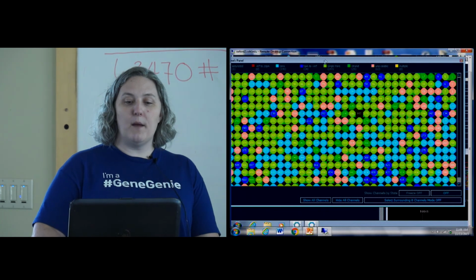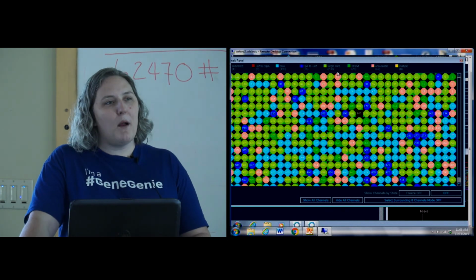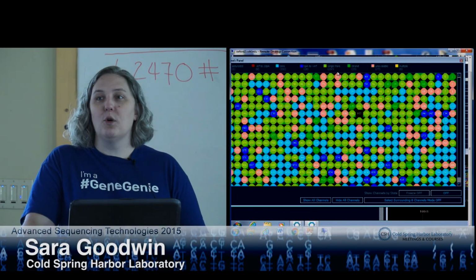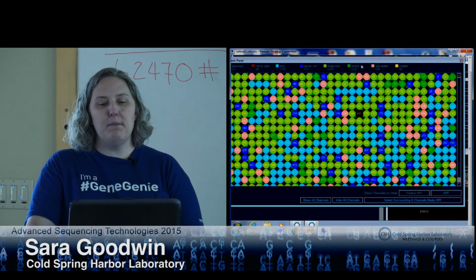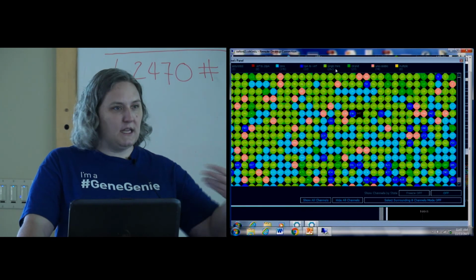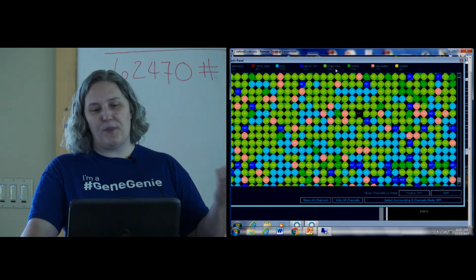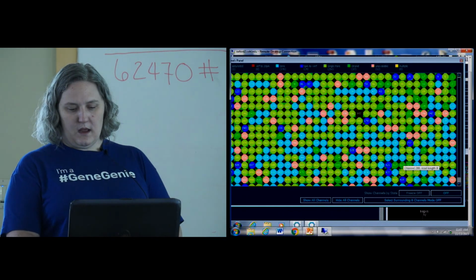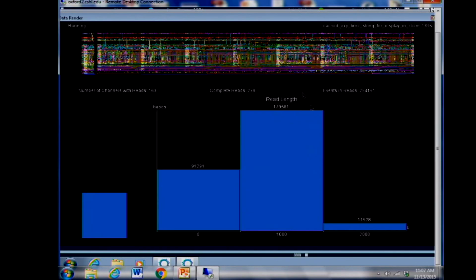There's still a fair number of things in single pore. Now, when you see this situation, that probably means you really haven't saturated your flow cell. You can afford to put more stuff on your flow cell and still expect sequencing to happen. So ideally, we want to see many, many more things in strand than in single pore. Fortunately, over the course of the run, we'll see more and more of those strand values increase as the flow cell runs. So we're at 34, 36 now. Single pore decreases.